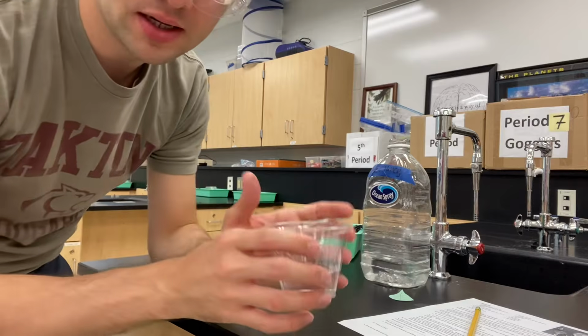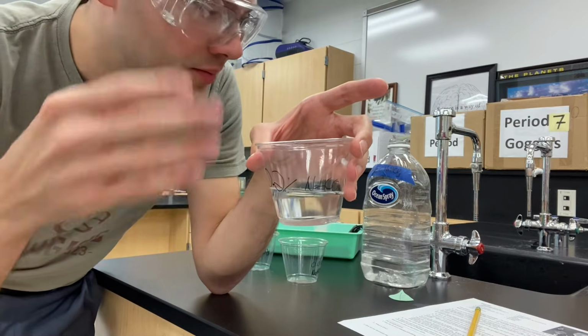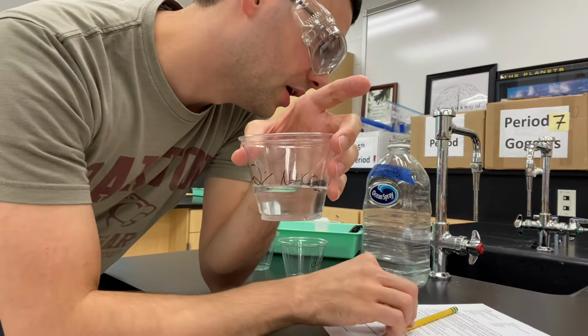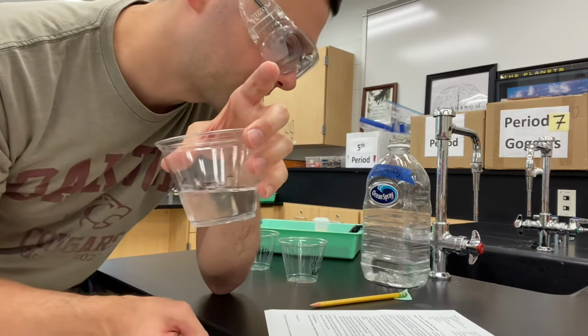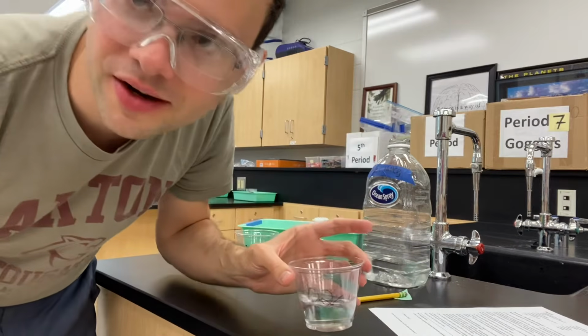This is a surfactant. It will help the discs behave the way that they're supposed to in the lab. Sinking them. Yes, sinking them. The soap wets the hydrophobic surface of the leaf, allowing the solution to penetrate and sink the leaf. Sorry, I forgot for a second.